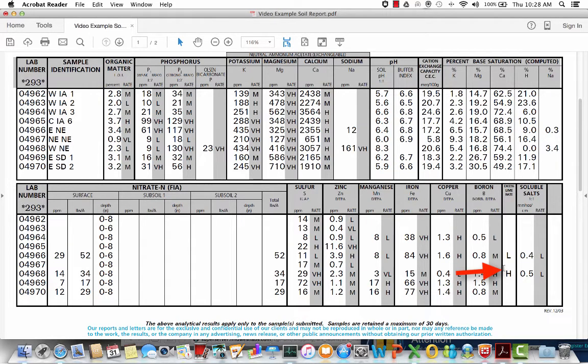This sample had a very high pH. This again is our western Nebraska sample with the 8.3 pH. There is, it looks like, quite a bit of excess lime in that sample because when we add an acid to it, there's a strong reaction. That indicates that there's probably some free calcium carbonate out there, and we should be aware of that because that gives us some of the same issues that we saw with the micronutrients.